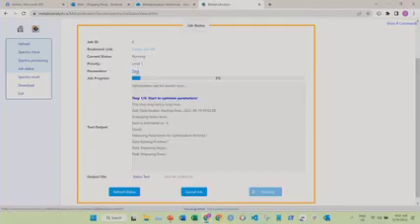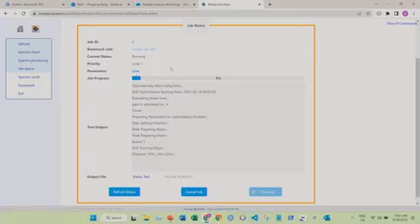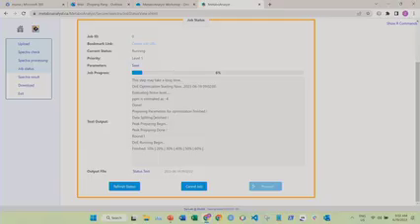They can also save the parameters here. For example, if you finish this data set this time, you want to save the parameters so that you can process data later using the same parameters. And you can download the status text. It's going to be a text file. You can save all of it for further reference.